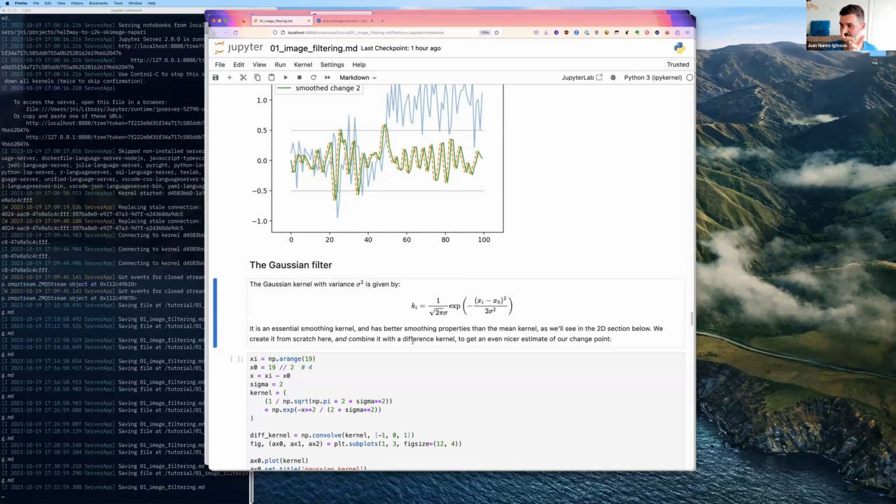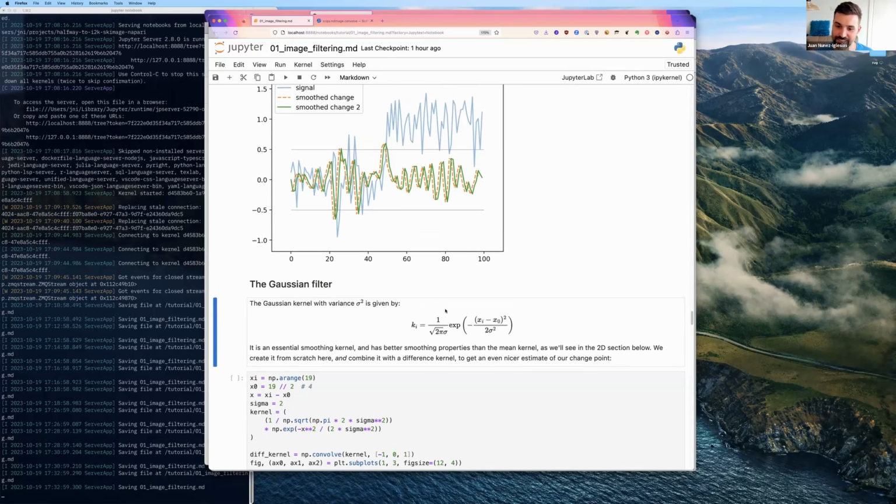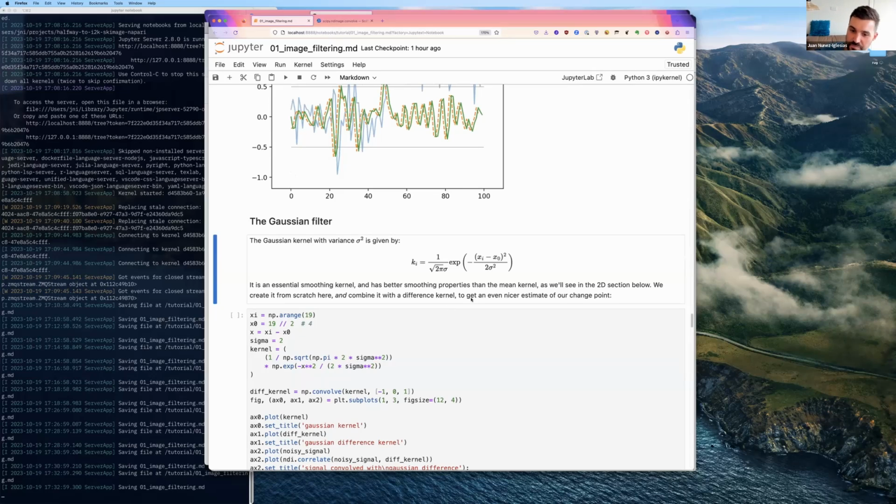So, say you're going along, you're smoothing, and now you want to determine the average centered on this pixel with a kernel of size 11. The value at the edge of the kernel has exactly the same weight as the value at the middle of the kernel, and that's a bit wrong. There's all kinds of mathematical theory why that's wrong, and that tells you that the optimal way, given some assumptions about the noise, is to use a Gaussian or bell-shaped weighting scheme for your kernel.